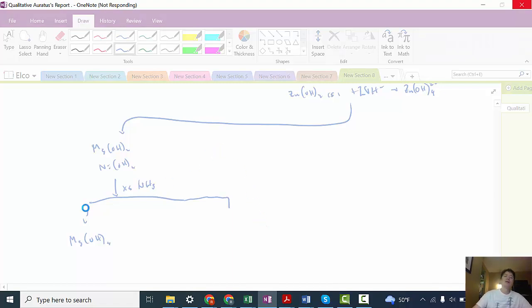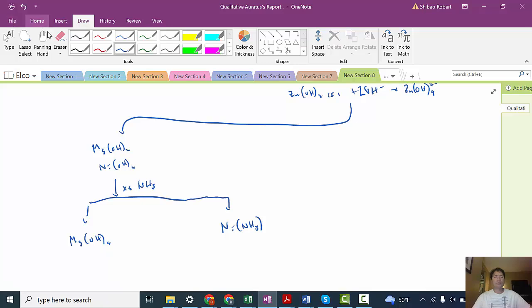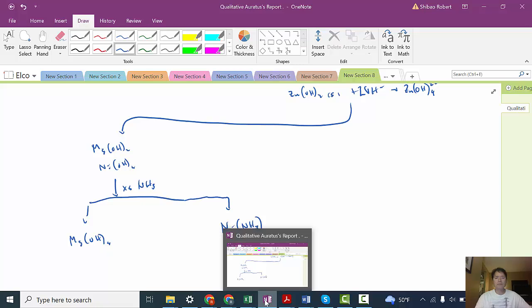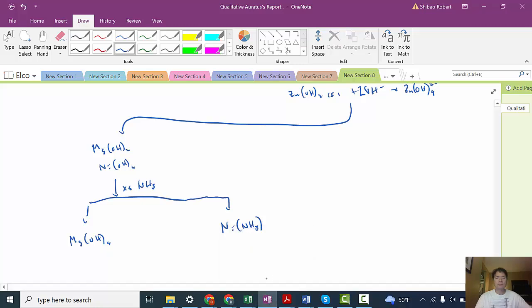And so we can take a look at Appendix D to see what it likes, or we can see other things as well. So the reactions that are happening here, maybe I should do a different color for the reactions. Magnesium hydroxide, solid, plus excess ammonia. We don't form a nice stable amine complex, so we'll just say NR.